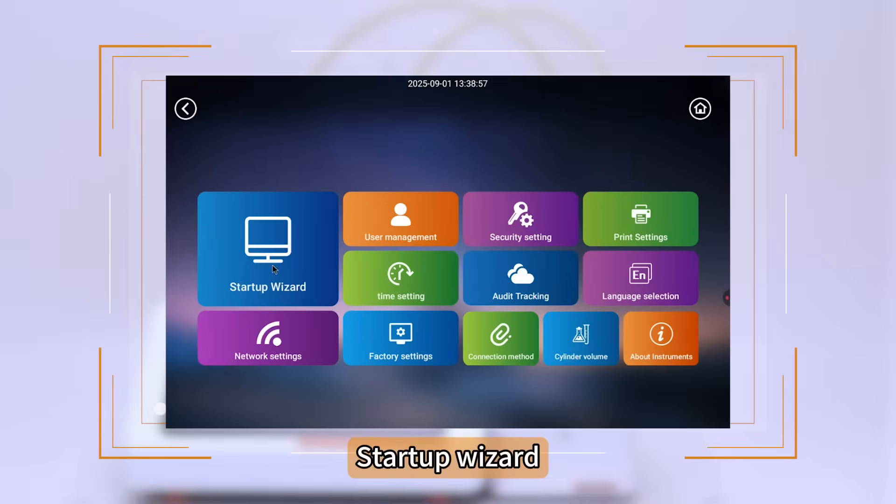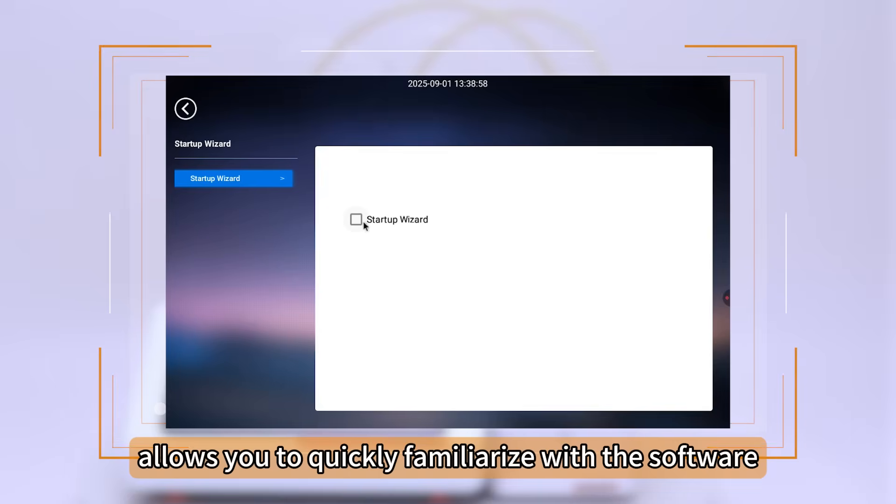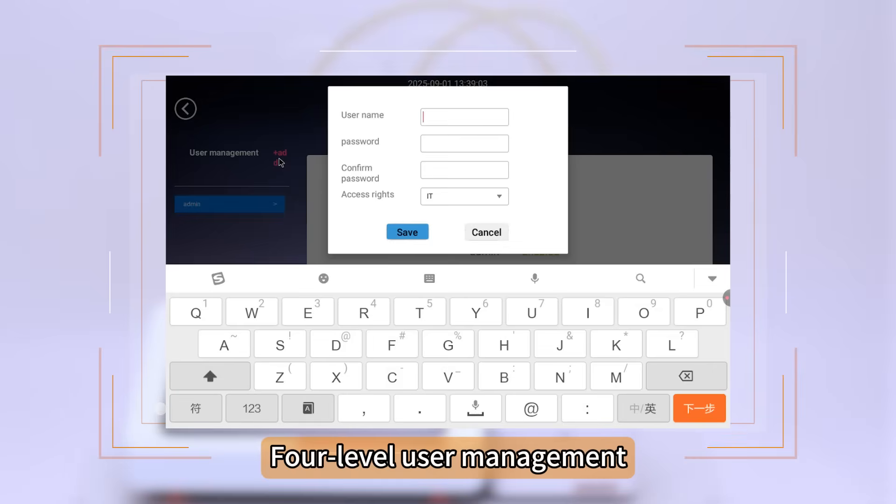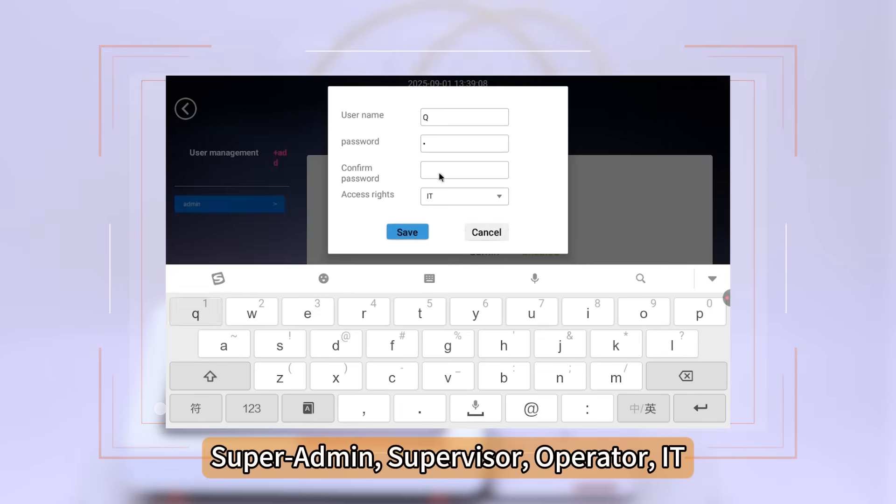Startup Wizard allows you to quickly familiarize with the software. Four-level User Management includes Super Admin, Supervisor, Operator, and IT roles.